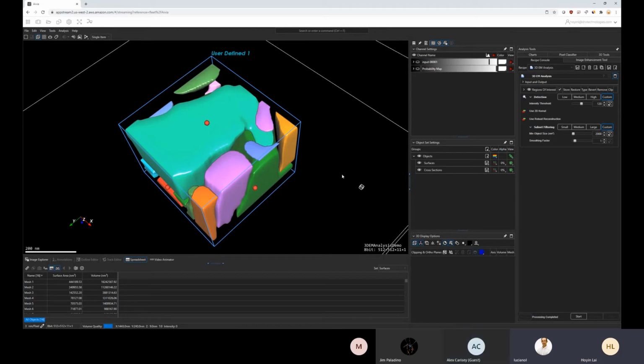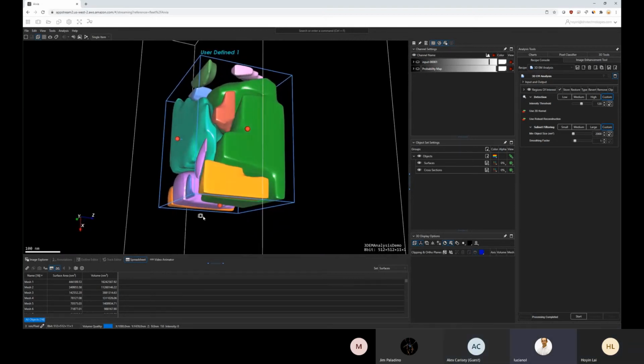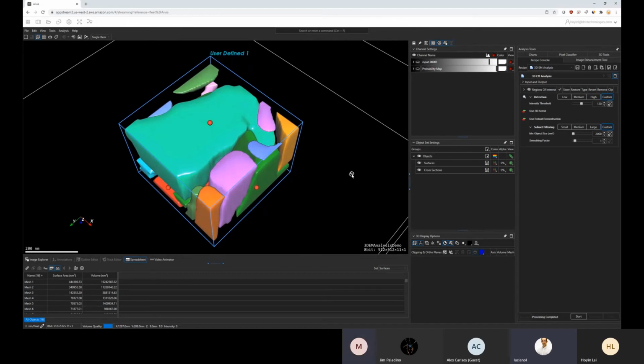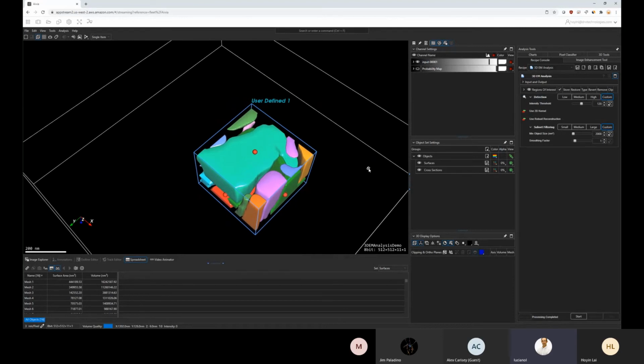At the threshold, you can try to pause the processing. There is a pause button there, which will unlock the GUI at the earliest convenience. So it doesn't immediately pause. It will pause once it gets to a natural spot in the algorithm that it's running. So it might still take a couple of moments to show it to you, but then you can run it.